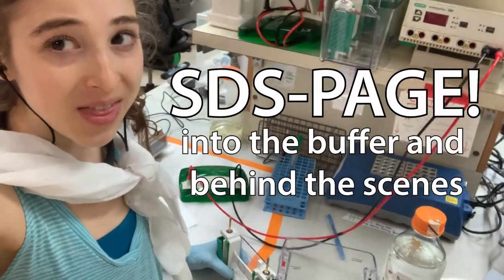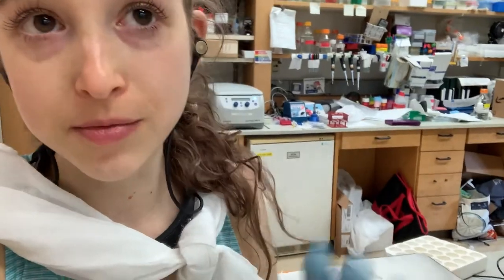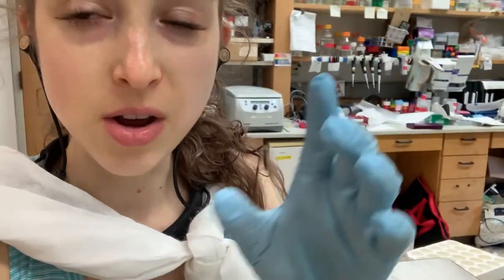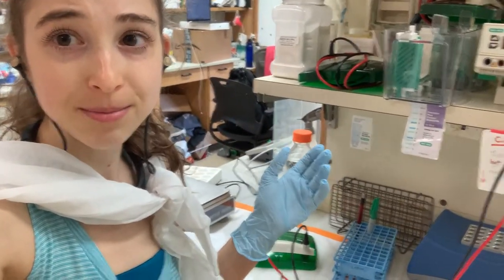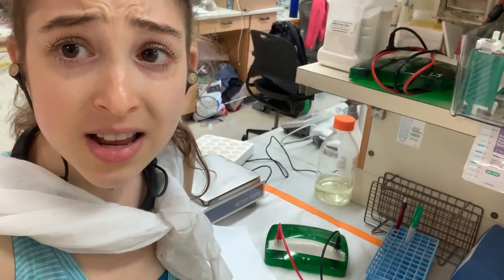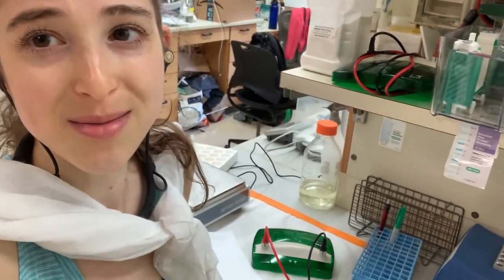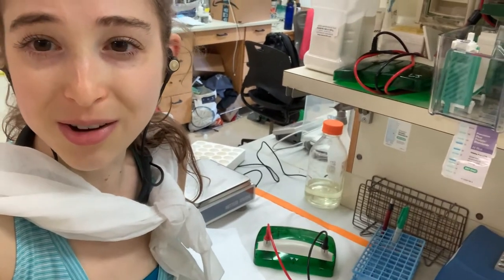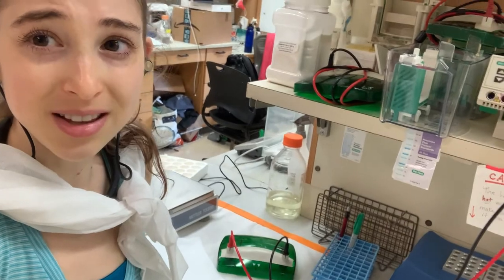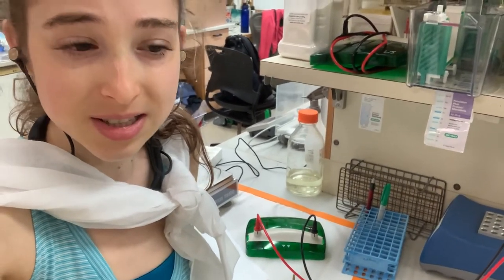As I work on adding pages to my thesis, I thought I'd talk about SDS-PAGE electrophoresis. I've talked about SDS-PAGE before, so in the beginning part of the video I'm going to repost the earlier video where I go over the theory, and then I'm going to give you a practical look at how we set it up and run it. I've run 738 SDS-PAGE gels through my PhD process — and that's only since I started counting, numbering them in my notes so I can reference back and forth between pictures. I know a lot of people don't know what SDS-PAGE actually looks like, and it's one of the most important techniques in biochemistry that you'll probably do if you take a biochemistry lab. So I wanted to give people a sense of what it actually looks like practically.